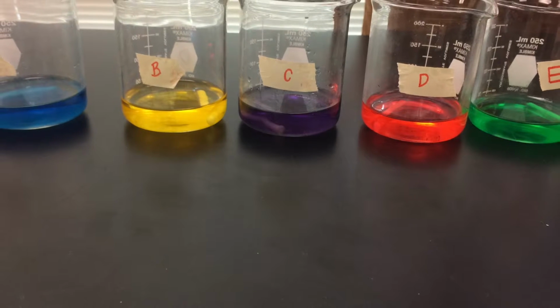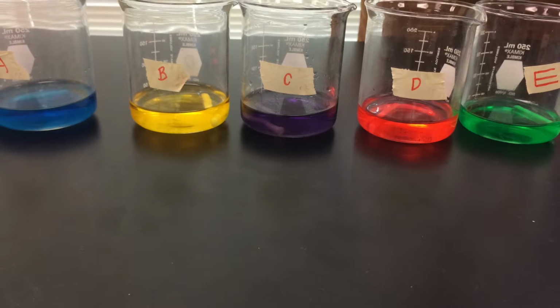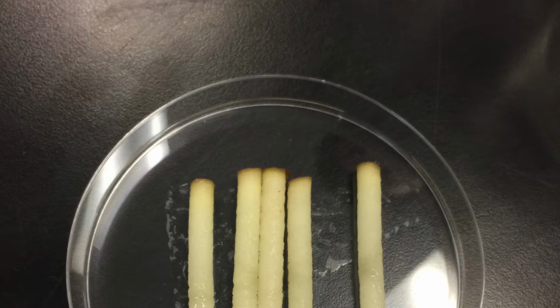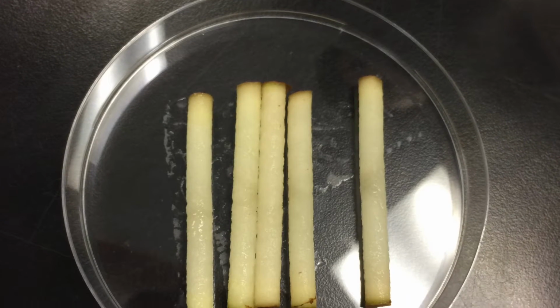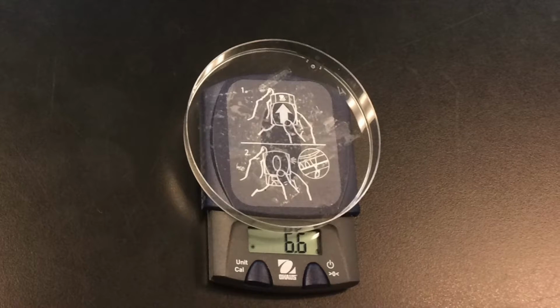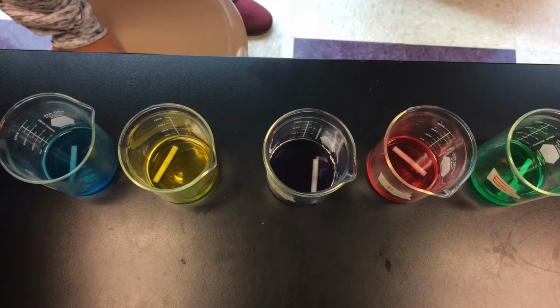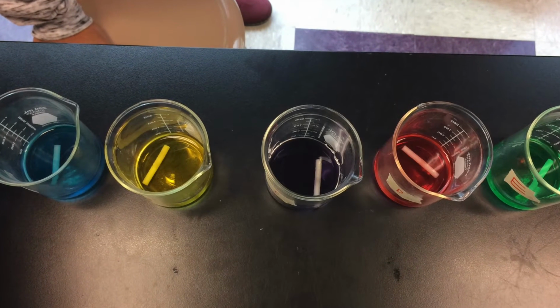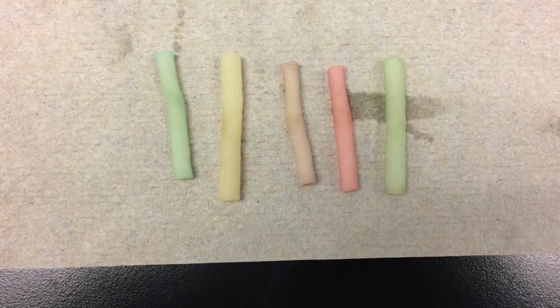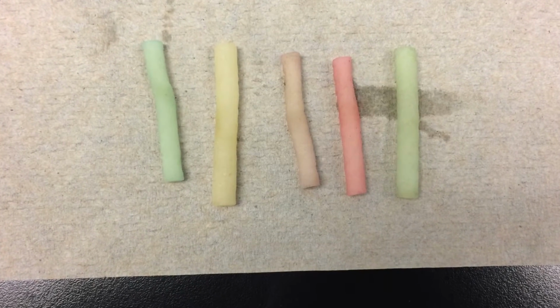First, they labeled beakers A through E. Second, they filled each with a solution with a different amount of sucrose concentration. After that, they bore 5 potato rods. Next, they measured the length of the rods and their weight. After that, they dropped the potato rods into the solutions at the same time. They left the solution overnight. The next day, they took the rods out of the solutions and measured their length and weight.